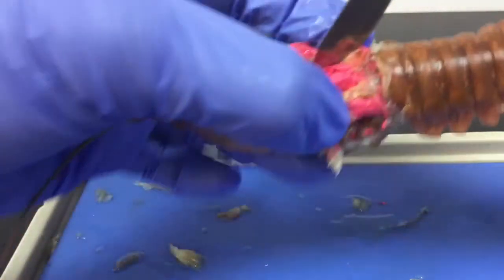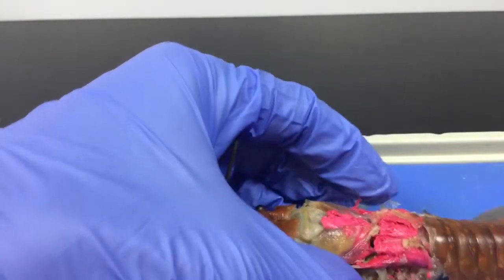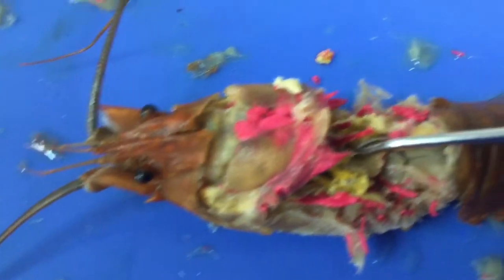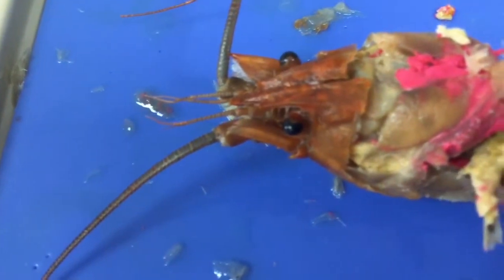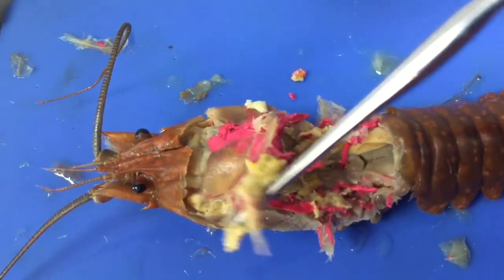So can you see this dorsal heart right here? And there's that pink gooey stuff. That's what we're looking at. All right, we've removed the dorsal heart and its associated tissue. It's been injected with latex dye, so it feels very plasticky. But in the living creature, it wouldn't. This yellowish tissue right here is the gonads. And then farther down, we'll see the intestines. Sorry, I'm having trouble doing the camera. So, there you go.